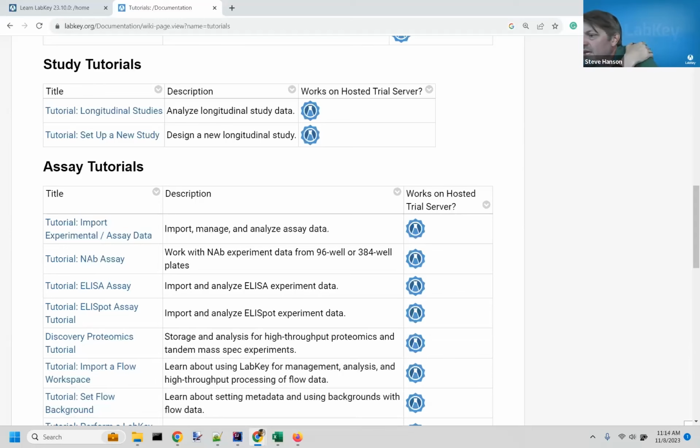Can you link different data grids by a common sample ID? I think if I understand your question, yes, you can. I think there's a couple of ways to understand this. Like an FMP, I don't know FMP. Feel free to say a little bit more about what you're thinking here. I don't know FileMaker Pro.